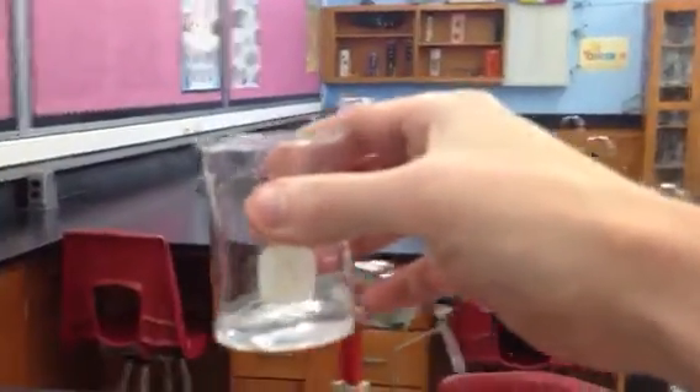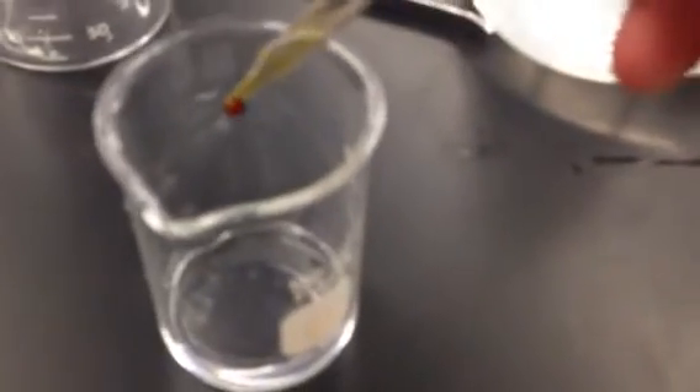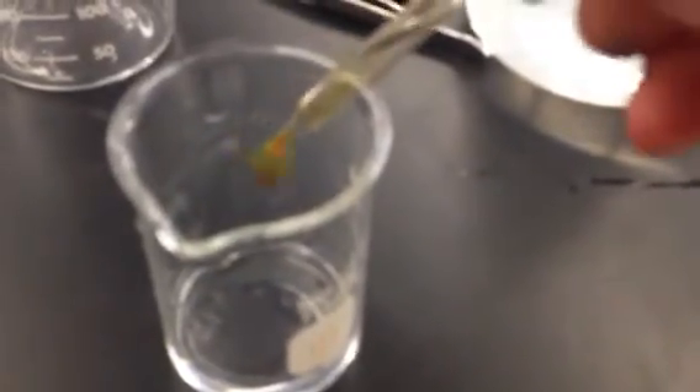I'll just put a little bit — it's very sensitive, even a little bit will show. I have very little starch solution in the beaker. You can tell that the iodine is brown. Now watch if I take just a little bit and drop it in. Look at that color change from brown to a dark purpley blue.